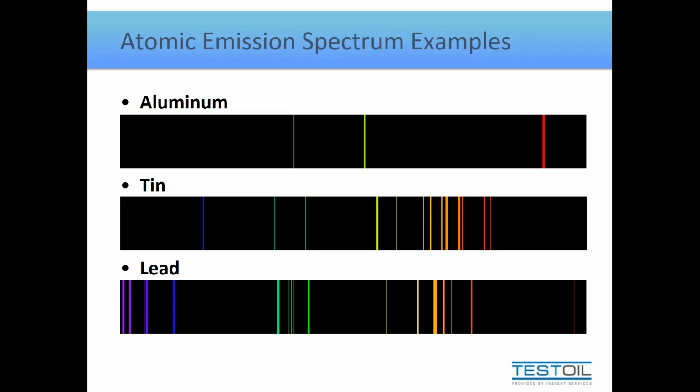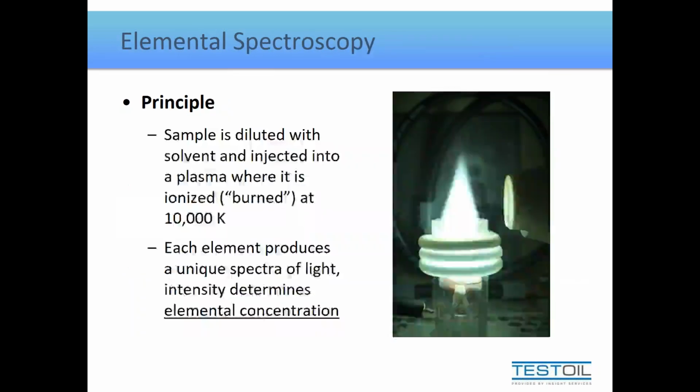The second fundamental aspect of this test that must be understood is that when the sample is injected into the plasma that we were looking at here, the sort of oval circular thing off to the right of the plasma is essentially the window that is looking at the plasma, and anything introduced into that plasma must burn up completely within that window.